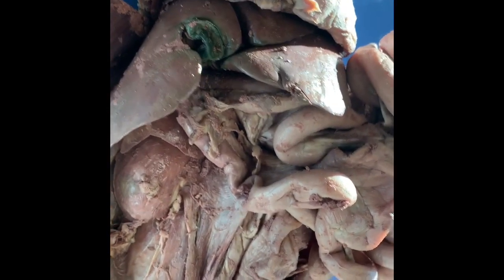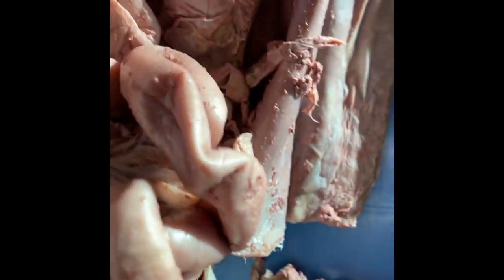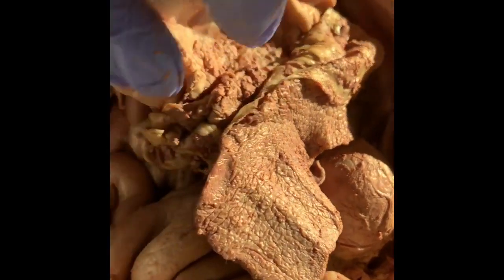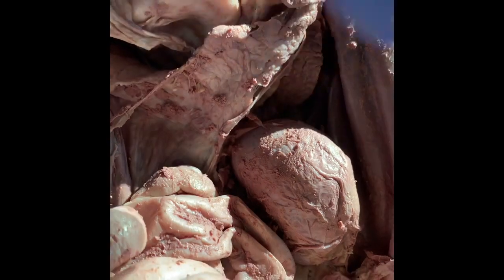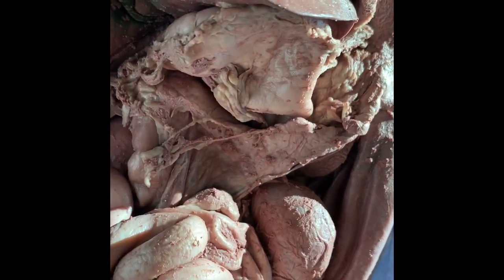So I've got the camera off the tripod, and I wanted to show you some of the things in a little bit more detail. So this is the spleen again, and it kind of looks like a big tongue. And then I wanted to show you the detail of the pancreas, and it's not very exciting, but this is all the pancreas right here. It has a segmented appearance, kind of off-white, and I don't know if this light is actually helping or making it worse.